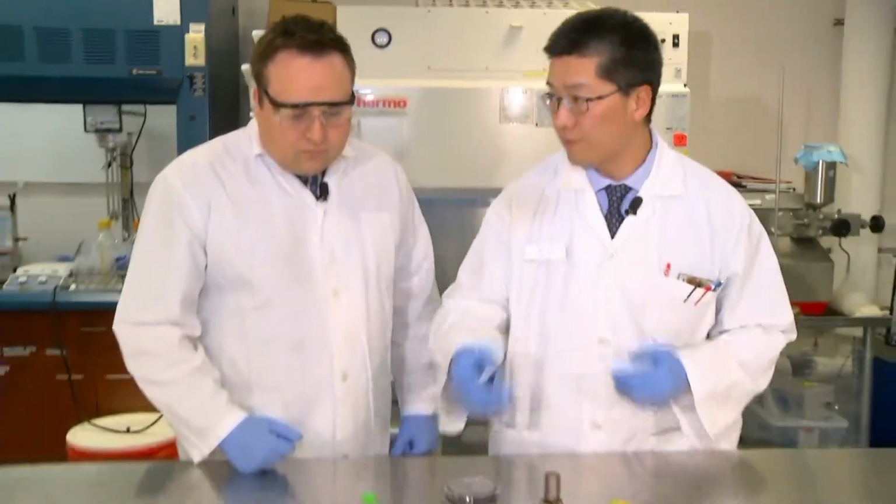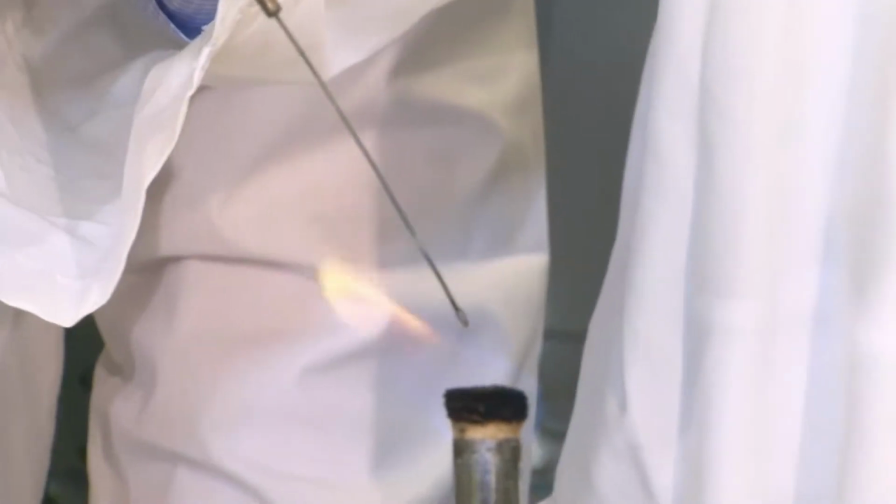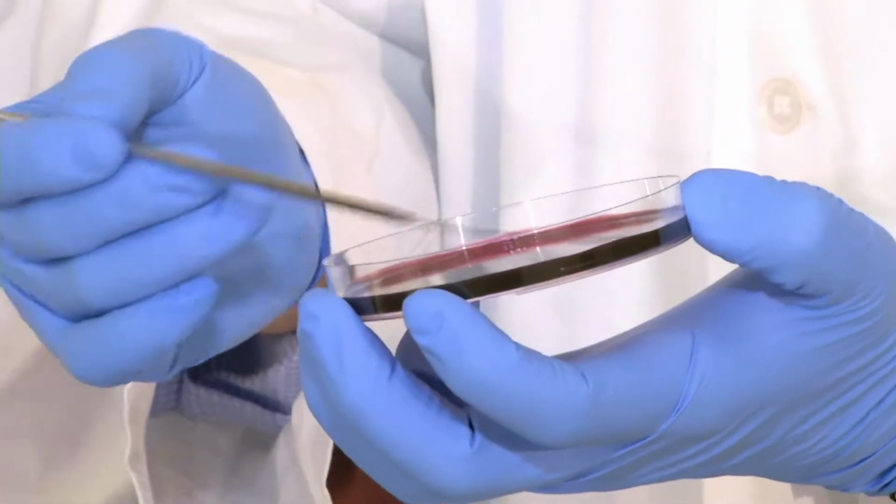In this lab, we deal with mostly bacteria because we are using bacteria to make a pharmaceutical for us. Most people think bacteria are bad. These bacteria that we're using are good. We're exploiting them instead of them exploiting us.